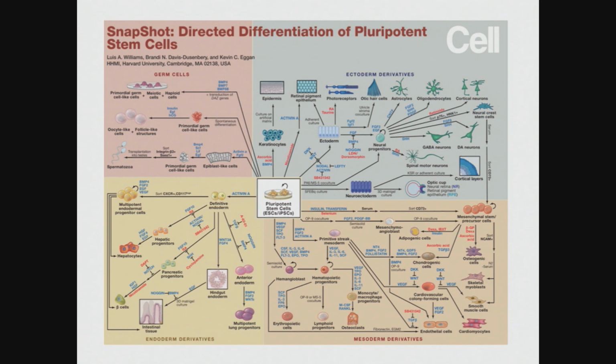Today we'll be focusing on endodermal lineages, and as you can see, the first major step in the directed differentiation of these cells, the first major patterning step, is deriving definitive endoderm. The main player here is the nodal signaling pathway, so it's through the addition of activin A. Once you get to definitive endoderm, the next step is patterning towards the organ lineage that you're interested in. We're interested in the lung, but of course intestine, liver, and pancreatic cells are all derived from endodermal lineages.